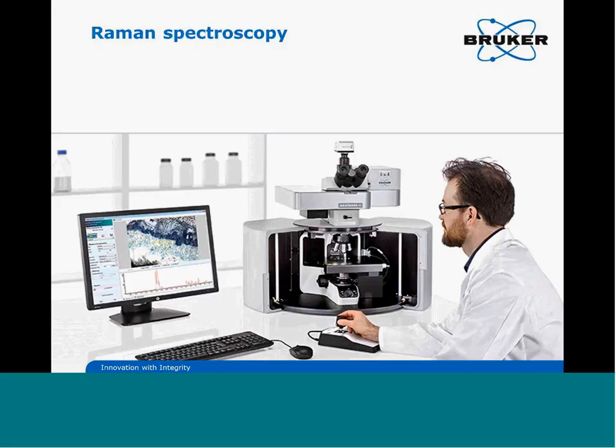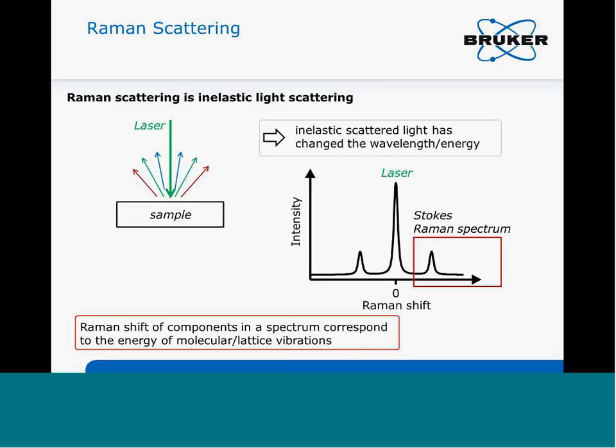Now, after talking about infrared spectroscopy, we switch to Raman. Raman is all related to the vibration of the molecule. When the molecule vibrates and the polarization of the molecule changes, the reflected light will also change frequency. So our experiment is done with a laser on the sample, and we measure the scattered signal. We only measure scattering at different radiation wavelengths.